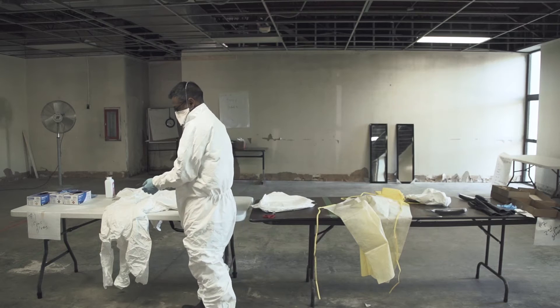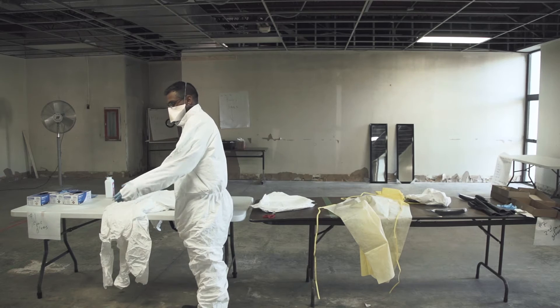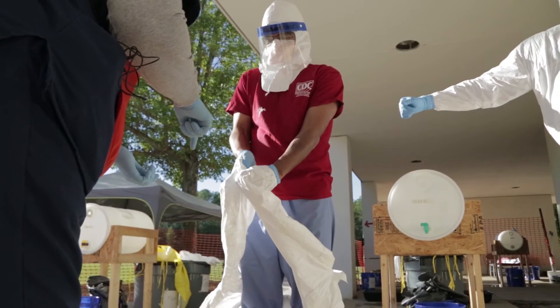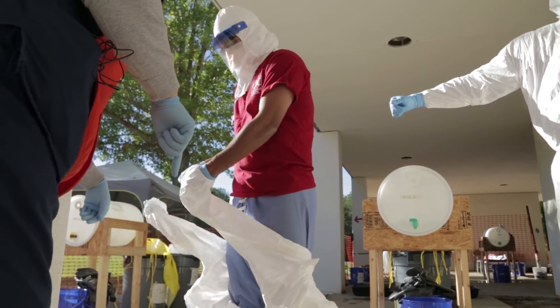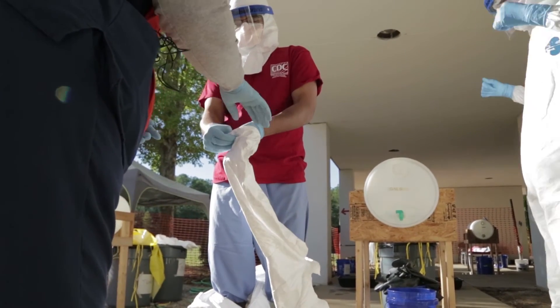Now in the suits, we've cut out holes for the thumbs so that when we are doffing or removing the personal protective equipment, we can take the outer layers off while still maintaining the inner gloves, which should not have been contaminated.